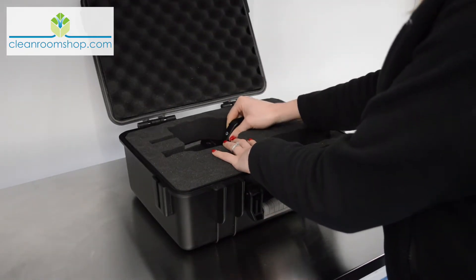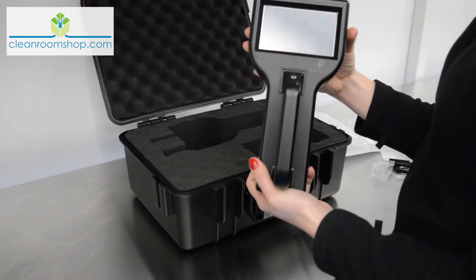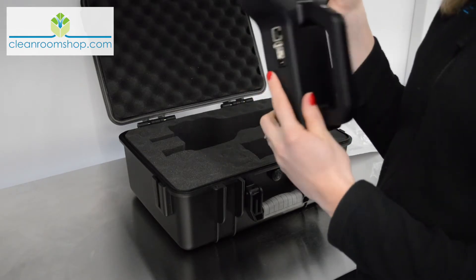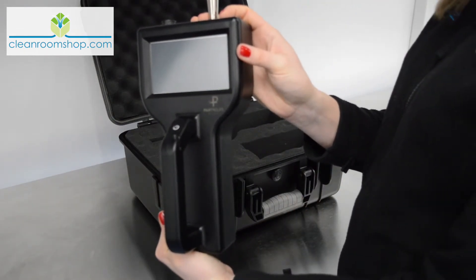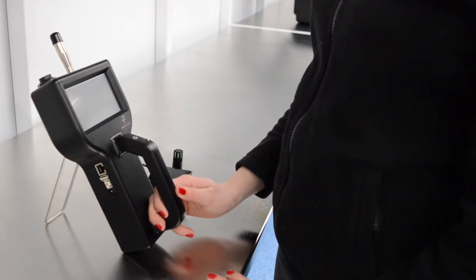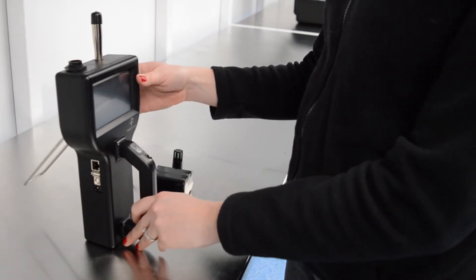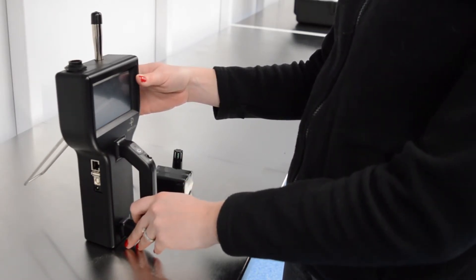Then there's the unit itself. It feels very light without the battery, which I'll add in later, but it's a really nice looking unit. It has a stand which can be used during counts in a turbulently ventilated clean room. In a unidirectional airflow clean room, you would stand it upright as the sensor probe needs to face into the airflow.